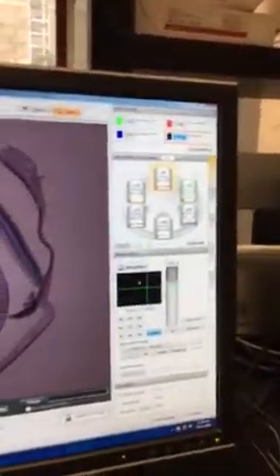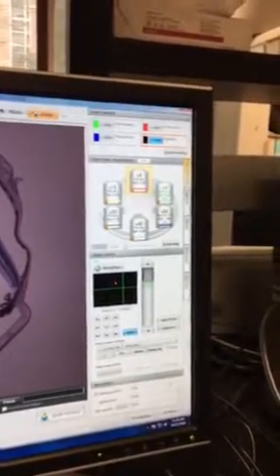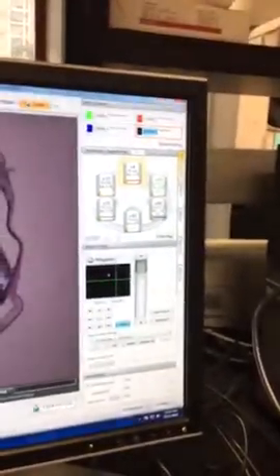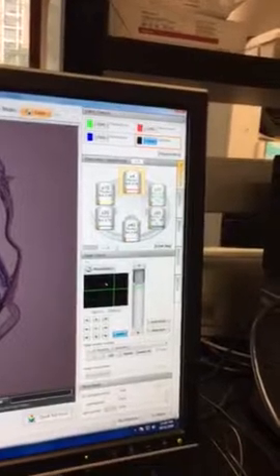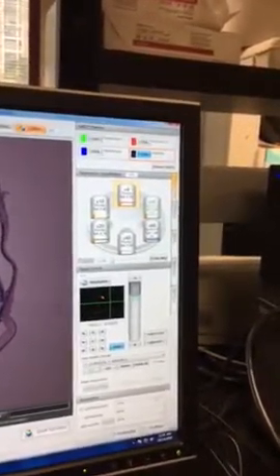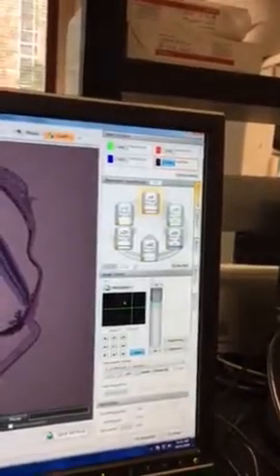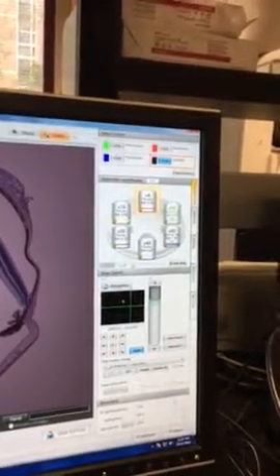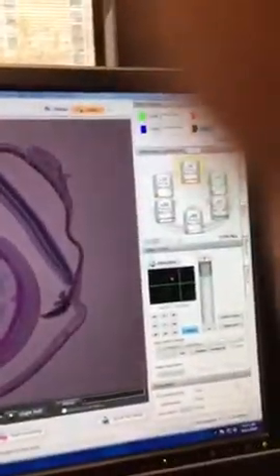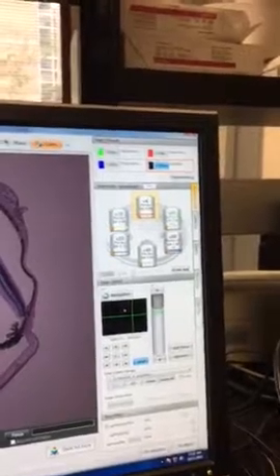I've already saved this image, but to click and drag to move it laterally, rapidly, you hit the control and you click and drag like you would Google Maps. Also to focus, you hit the control key and then you can quickly focus. So now I'm going to go ahead and get this up to the upper left hand.